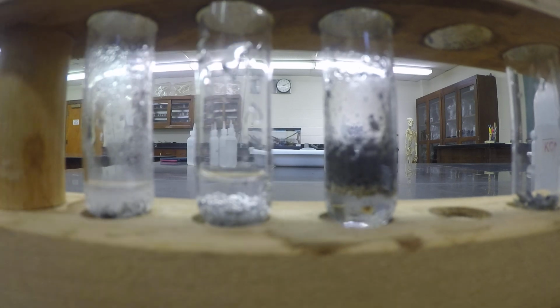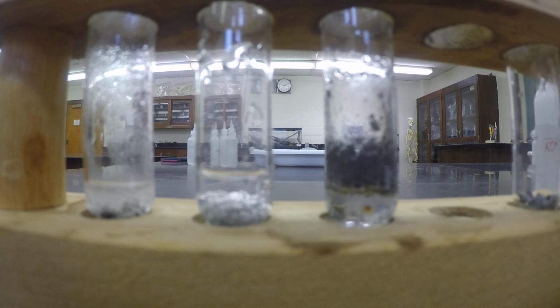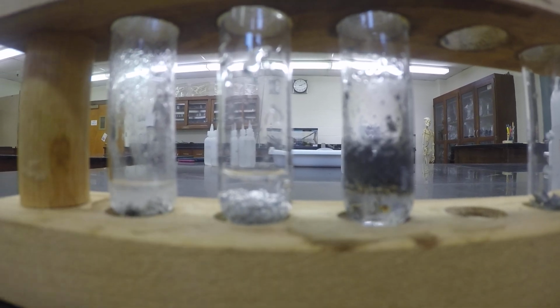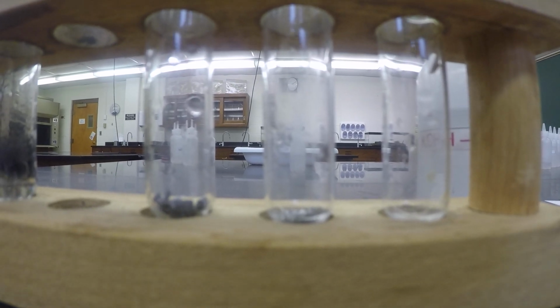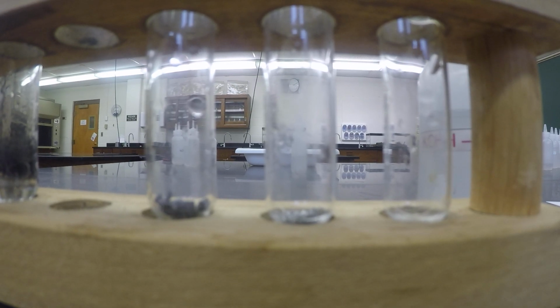And I can see a little bit of movement in that second one. Okay. So now I'm going to go over these ones. Okay, so this is the same thing. We've got magnesium. We've got some zinc. I'm going to add iron to this last one.